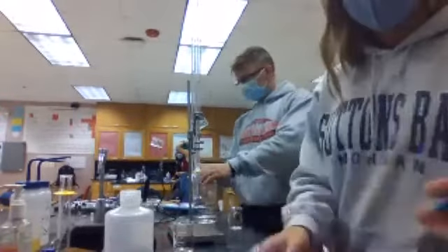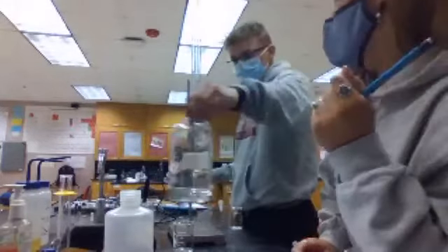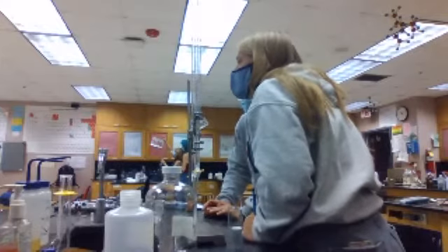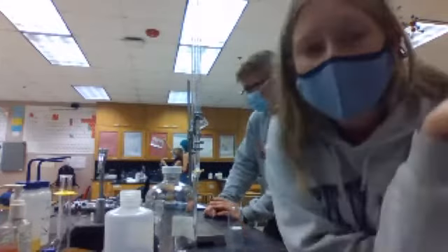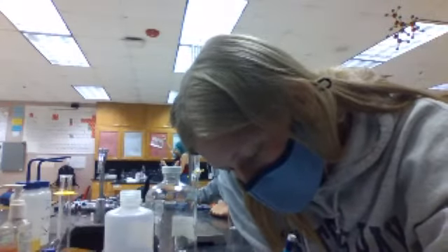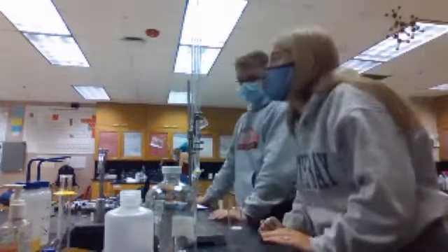So for unknown number 1, trial number 3, the starting acid. Okay, so the initial volume of the HCl is 19.99. 9.9 or 9.8? She said 9.9. Okay.